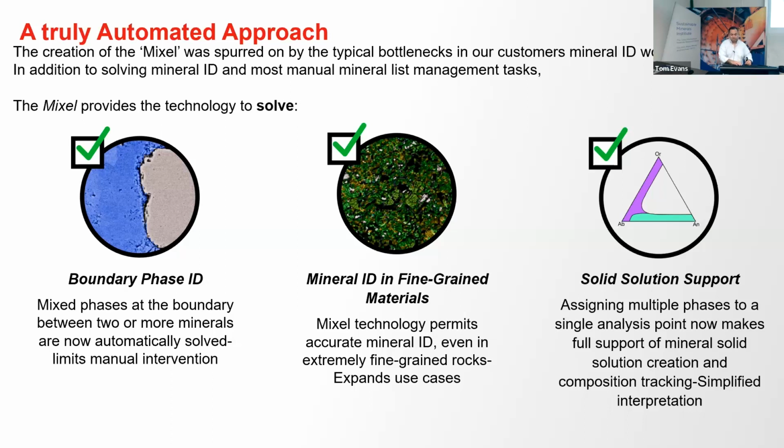So all these elements might be present in our minerals in different proportions. Sometimes the most interesting metals are actually impurities in these minerals. So we wanted to incorporate this concept, which we use always in geology. We wanted to make sure that the software understands that we are talking about things that don't have a unique composition.